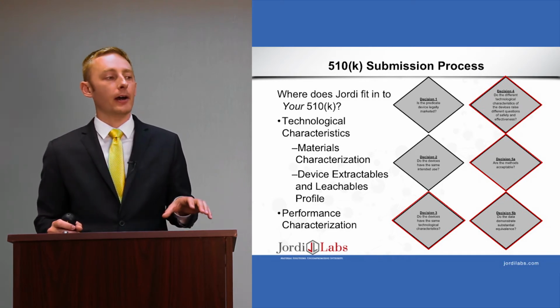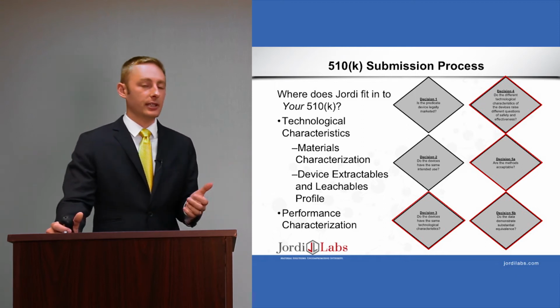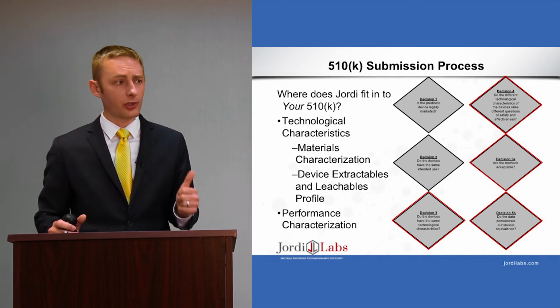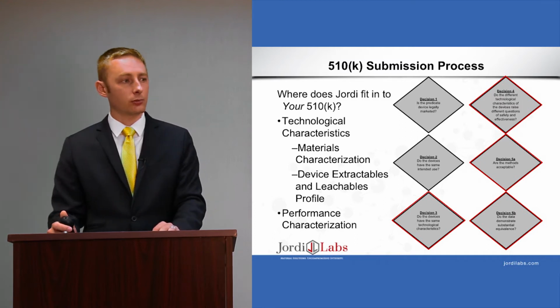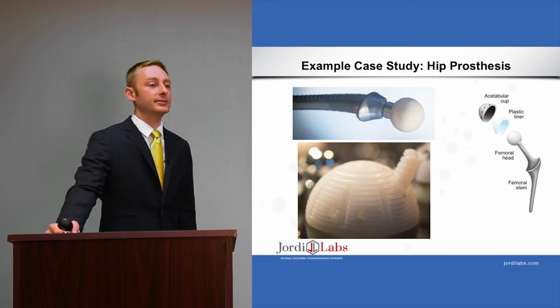Additionally, we can help with performance characterization because they're not only interested in what gets left in the patient as the device is implanted in someone, they're also concerned with how it's going to perform over time. And I have a case study at least where we cover a little bit of that. So we'll get to that in a moment. Here we are. So here's the example case study.